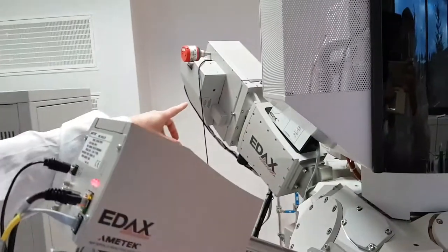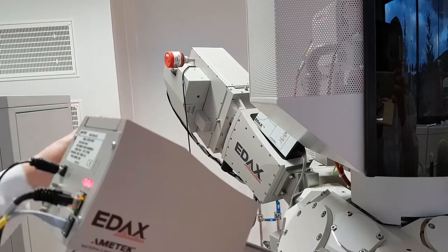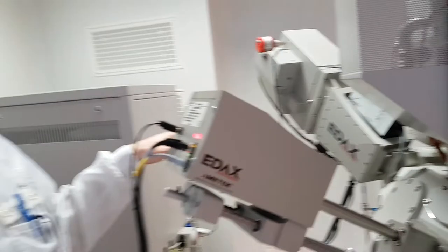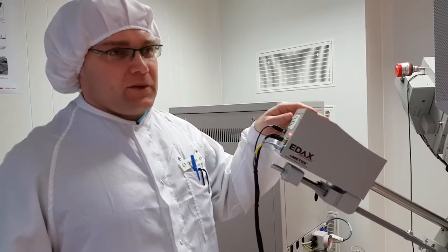And that one in the rear is so-called WDS, so wave dispersive spectrometer. And so what's the benefit? This one and that one are used to gain chemical information. This one for, let's say, quick analysis.